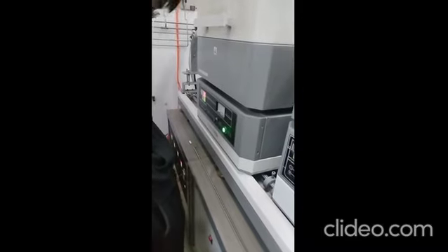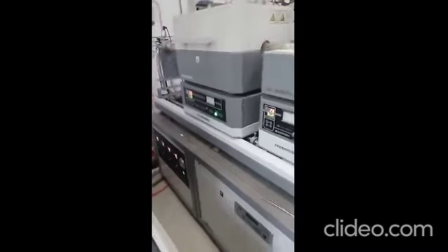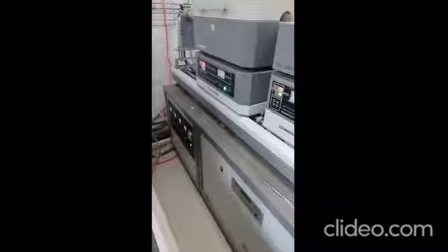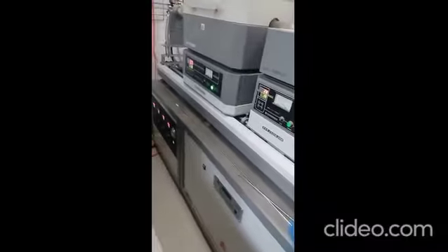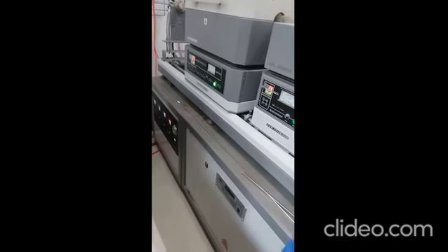So just wait 1 hour. And we come back and switch off. No, we don't switch off. We use CH4.